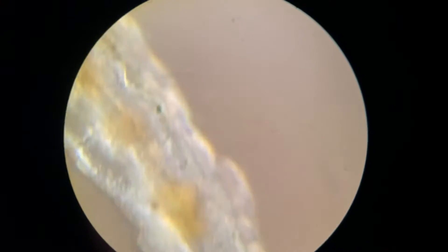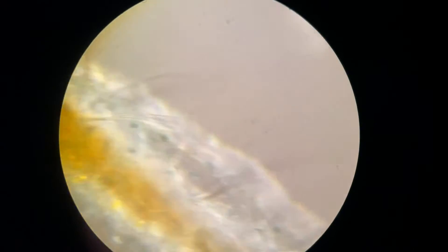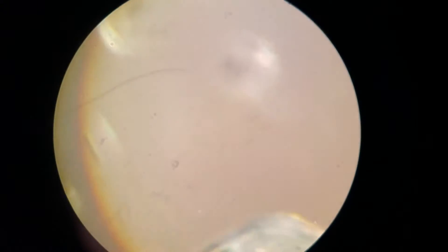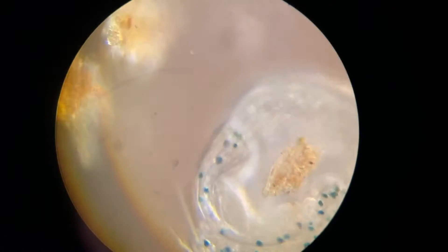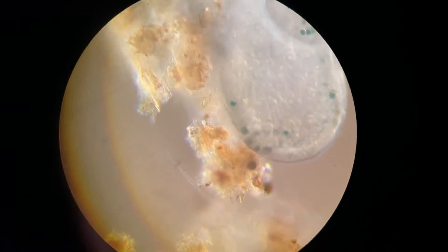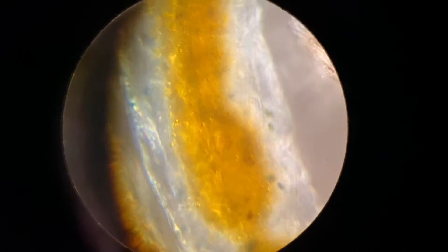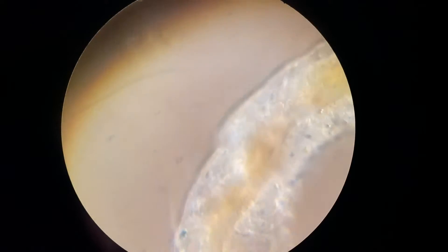Here's the same worm just kind of zoomed in a lot more. You can see it has little hairs I think it uses to move around. That looks like its digestive tract. Let's go up to the face - here's the front of it. It's so gross. It's got little black dots everywhere. This thing is really cool. I wasn't actually expecting to see anything this cool - I was mainly just expecting to see a bunch of little tiny dots moving, but this is really interesting.